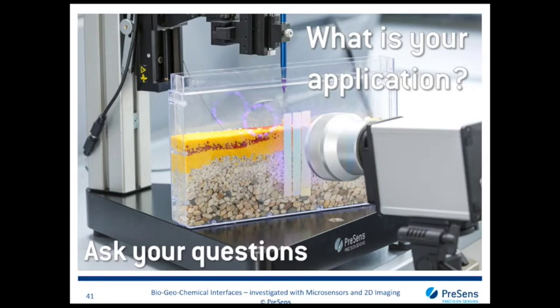Depending on the roughness or the toughness of the substrate, it depends. The microsensors are of course limited to a certain grain size. If it gets too coarse, for example, here you could still measure down with a microsensor, but if it gets too coarse, like really hard rock we have down here, or some hard shells inside, I would recommend people to use a dipping probe instead.